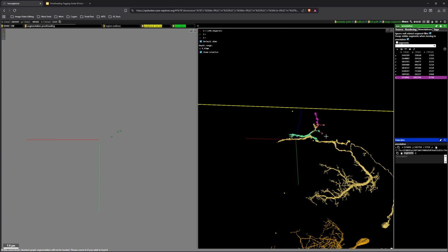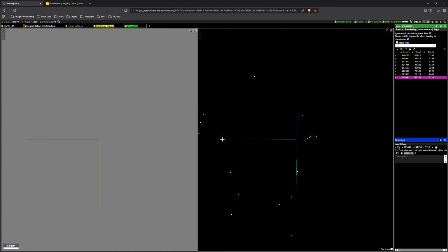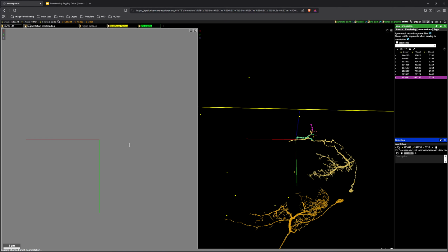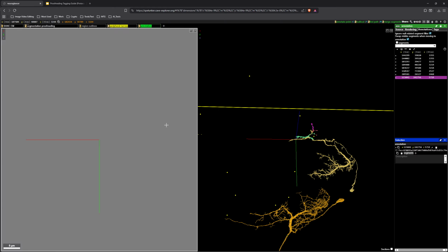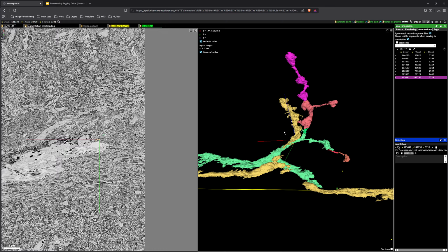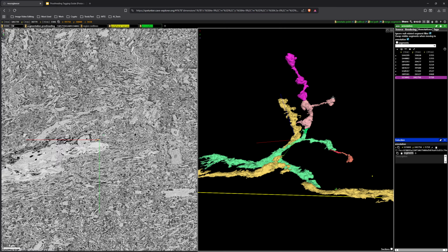So these two, let's take a look at the 2D once it starts to load again. I'll do a refresh. As you can see, we have the same situation, but from the opposite direction. And if we zoom in, you can actually see that this example is a neurite that has a few extra branches.